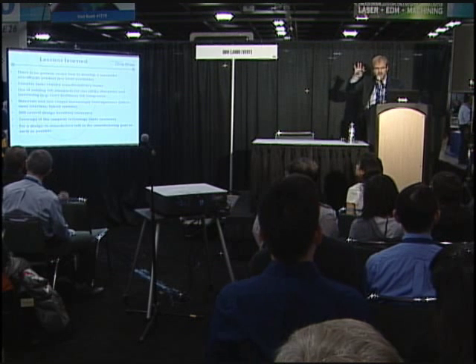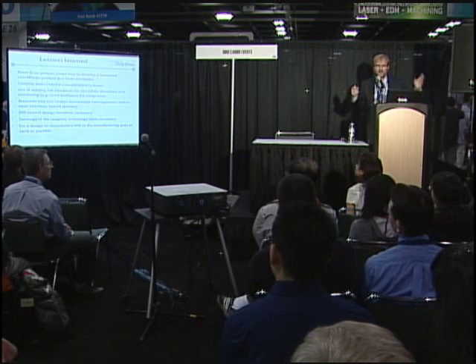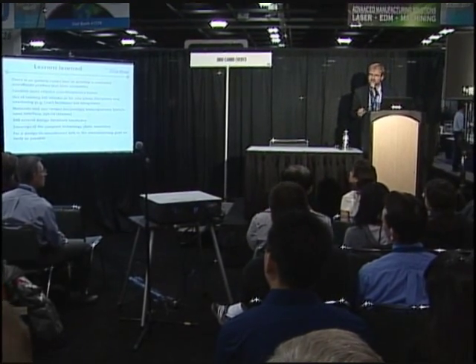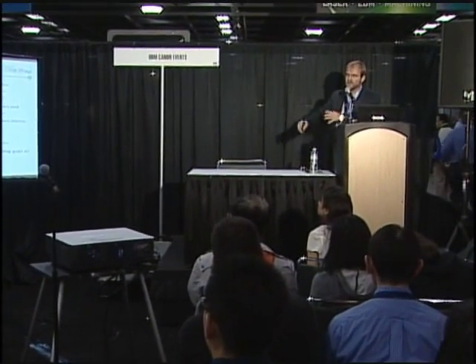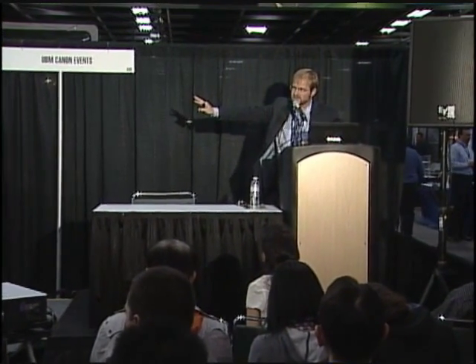One of the important messages is look at your target markets and look what is there already in standards like sizes for devices, like spacing of ports, like existing fluidic interconnects. I think one of the reasons why many of the early pioneering companies failed is they all built standalone systems which did not interface well with existing lab standards or lab workflows. So keep that in mind and try to make your Microfluidic system as easily integratable in existing lab protocols and equipment as possible.